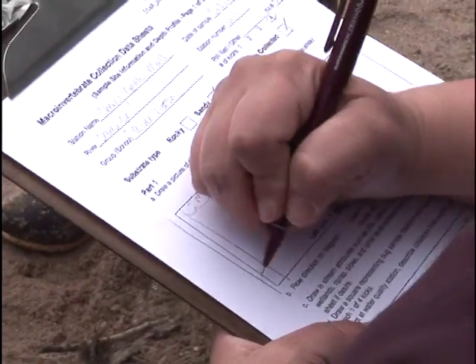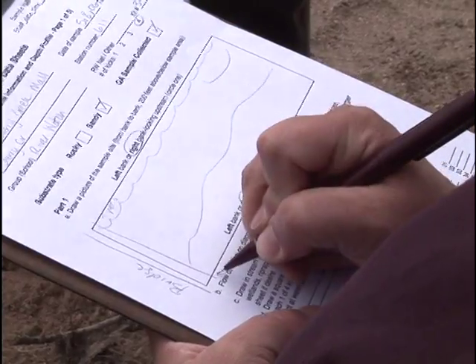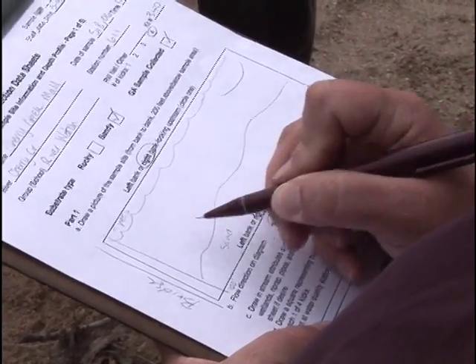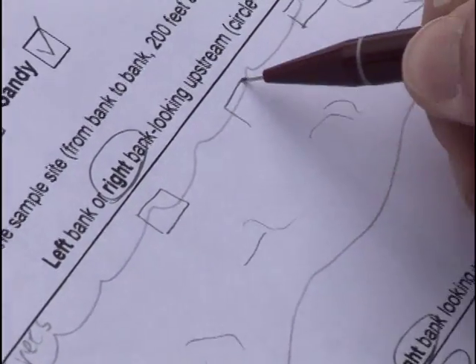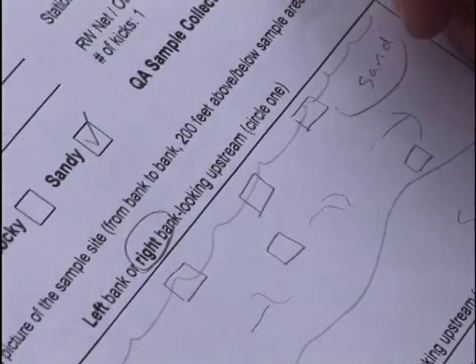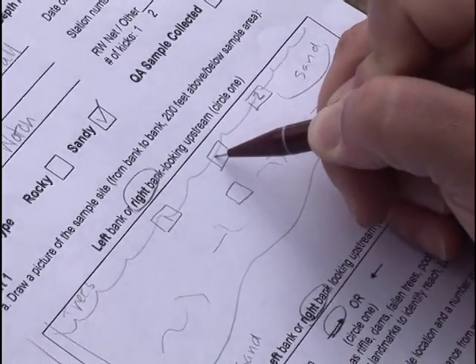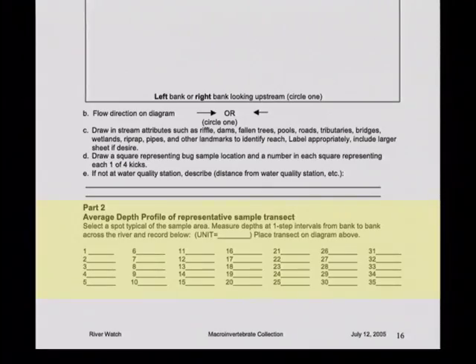Draw on any stream attributes such as riffles, dams, fallen trees, pools, roads, pipes, and other landmarks to identify the reach. You will also need to indicate where you have taken your composite samples from. If you are using a kick method, draw a square over each riffle that you had sampled for the kick method. Now we need to record our average depth profile.